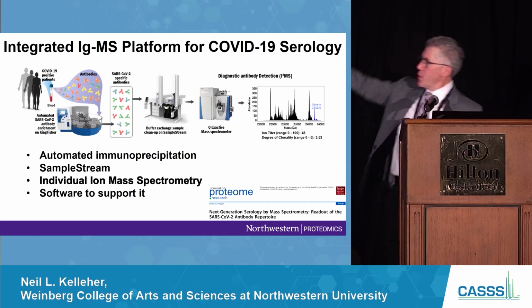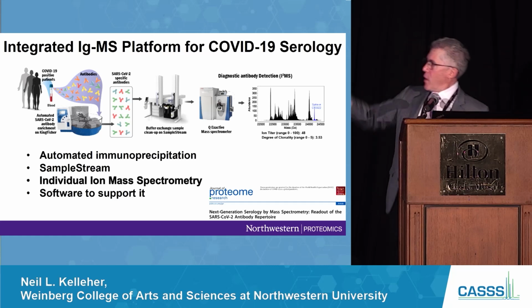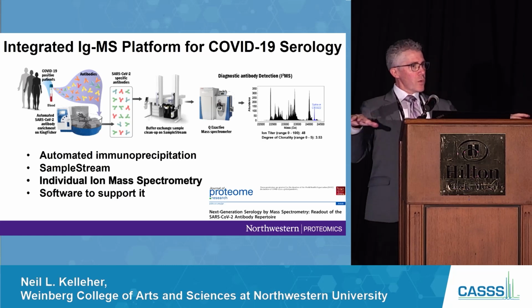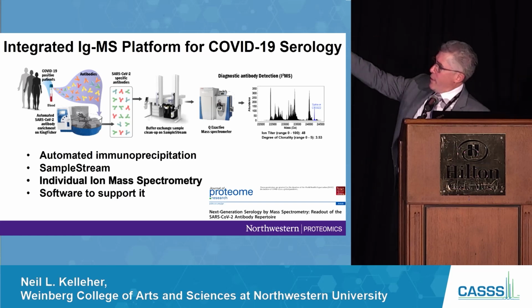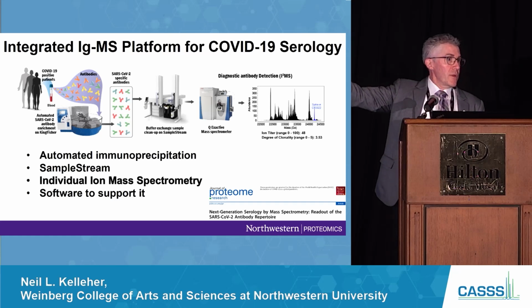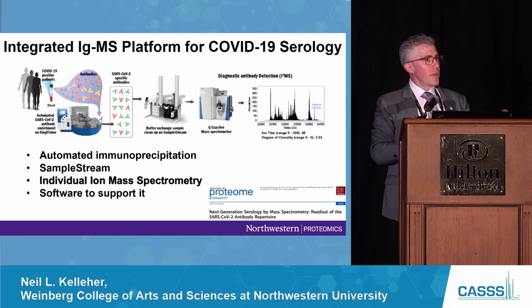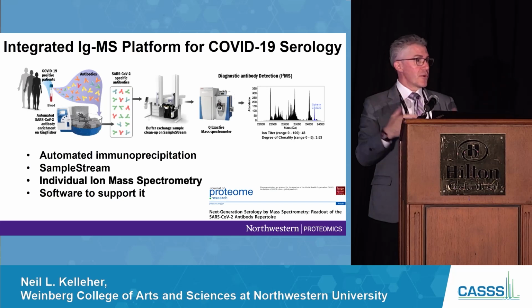So she's interested in what's below those humps. How many clones are down there, right? And fair point. We probably only have 2 logs of dynamic range in that spectrum, and so maybe there's a lot of low-level but many clones for an older person. But I would still argue the same core message of the talk: that thing correlates to phenotype more tightly than other data types. That's the actual relative abundance of your clones in your blood, swimming around. That's your degree of protection in a vaccine context, or your degree of clonality in fighting antigens. But it's true what you say. Maybe there's one clone down there that, if stimulated, in a 78-year-old with a bacterial infection, gives plenty of response.